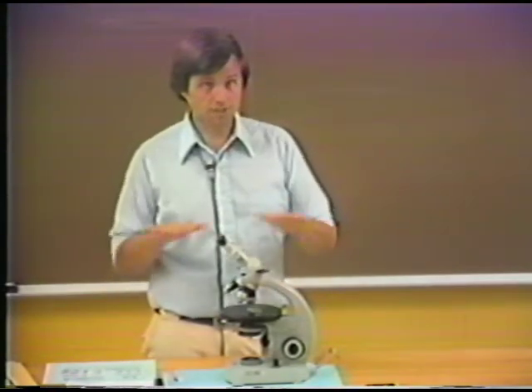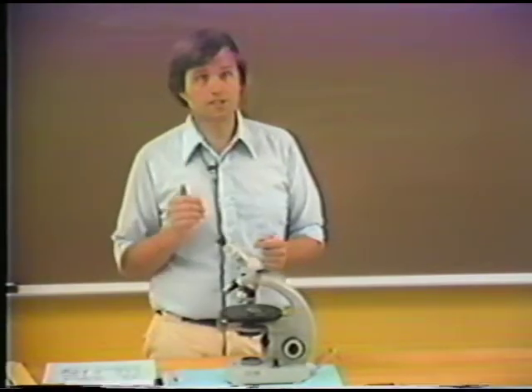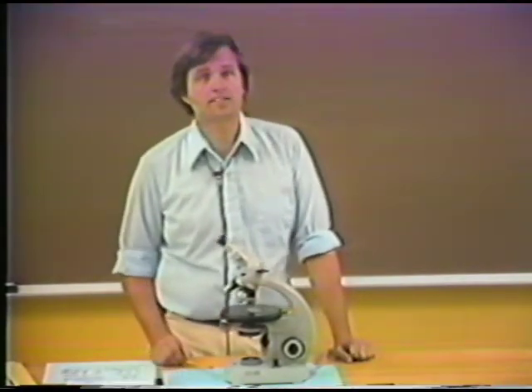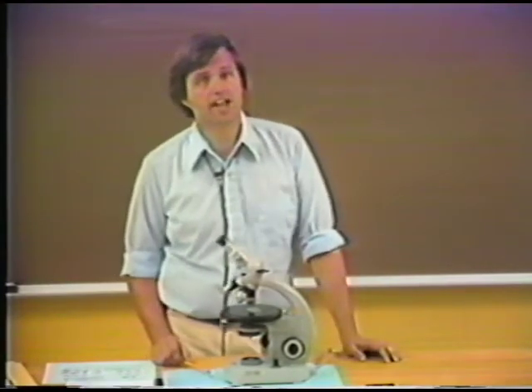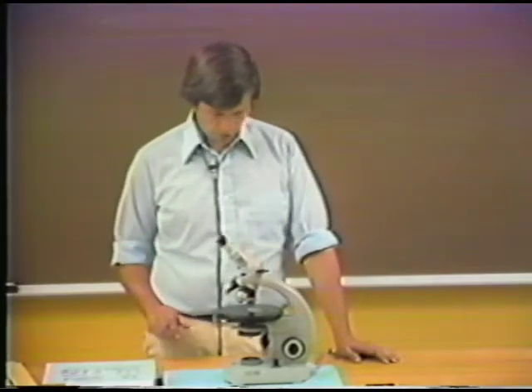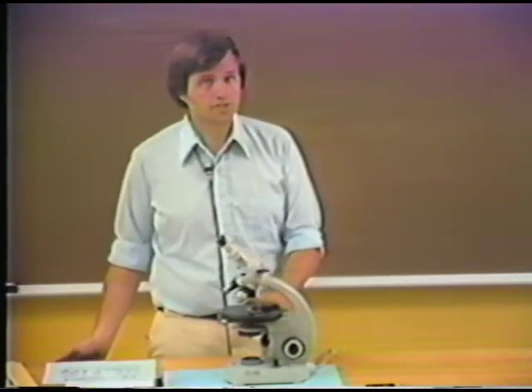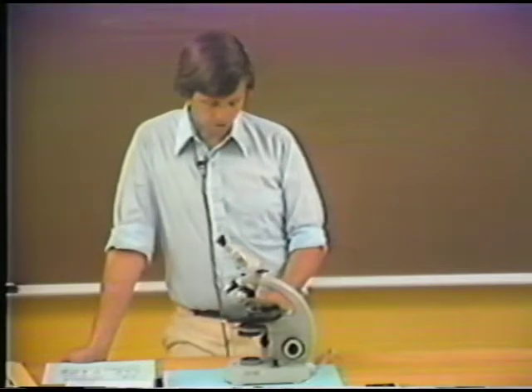I mean, both of the sections that we've talked about, the horizontal section of the indicatrix and the vertical section of the indicatrix, are very special kinds of orientations. What happens if the C-axis has some angle to the stage? And this is the normal kind of randomized mount. Then what kind of figure do we see? And I'm going to show you a series of different interference figures depending on the different kind of orientation and how close the C-axis is to parallel or perpendicular to the stage.